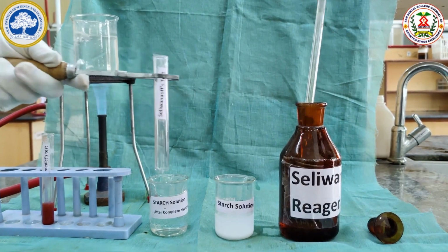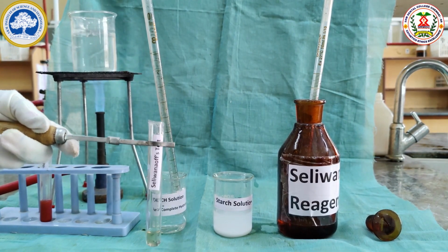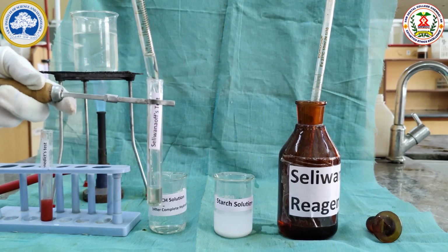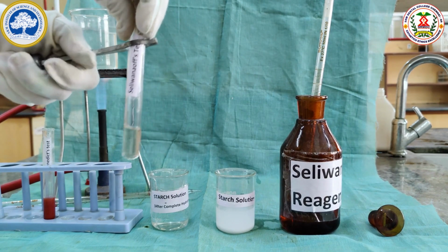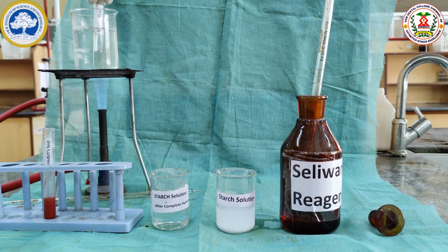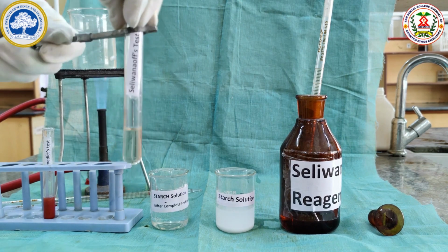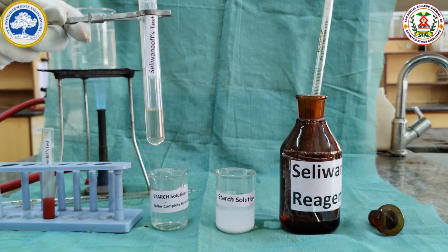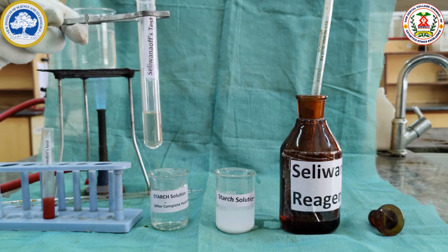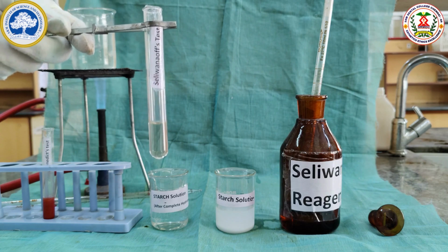For Seliwanoff's test, 1 ml of Seliwanoff's reagent is added and 1 ml of the sugar solution is added. Seliwanoff's test is a test for keto sugar and this is kept in the boiling water bath for 1 minute. After 1 minute, we can see there is no change in the solution. If keto sugar is present, we can see the formation of cherry red color solution. Glucose being an aldose sugar, there is no color change. So this shows that starch is formed of the reducing sugar, glucose.